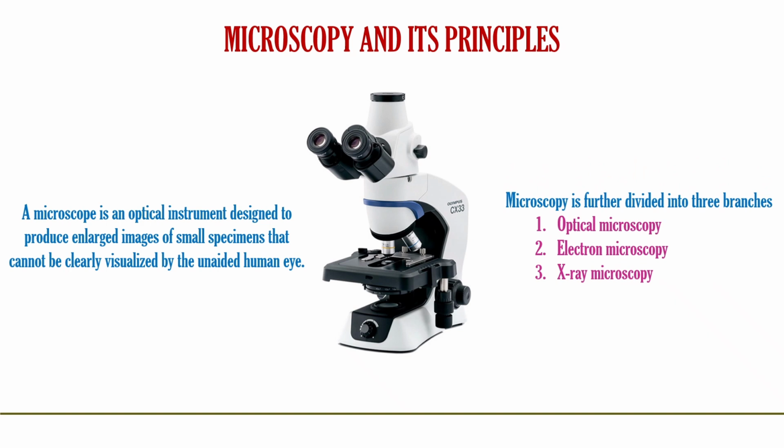Microscopy, importantly optical microscopy, began with the discovery of the first microscope by Antony van Leeuwenhoek. In an optical microscope, the rays of light are passed through a series of glass lenses to produce a magnified image on the observer's eyes. Compound microscopes are the most common type of microscope, mostly used for research and teaching purposes.